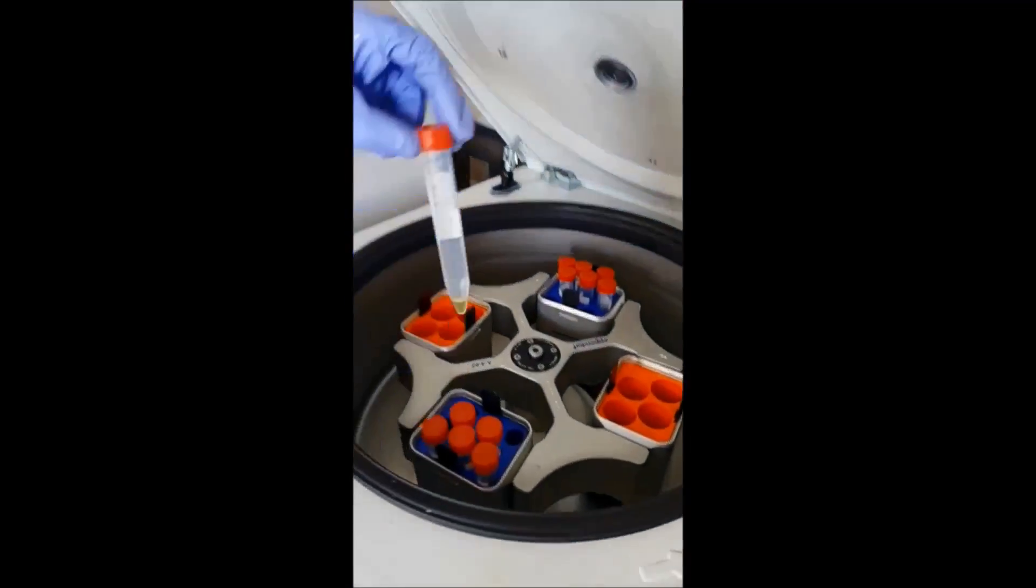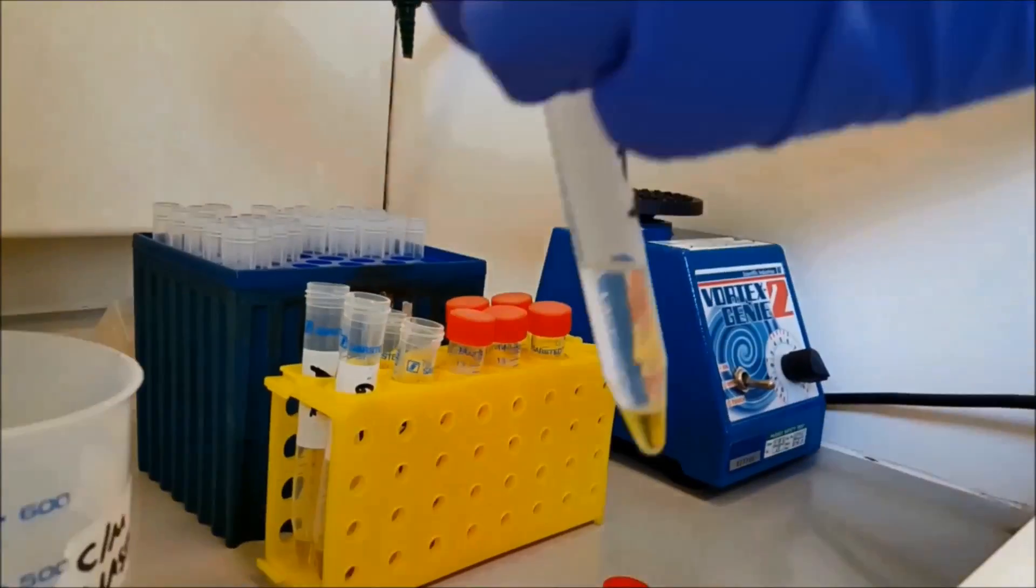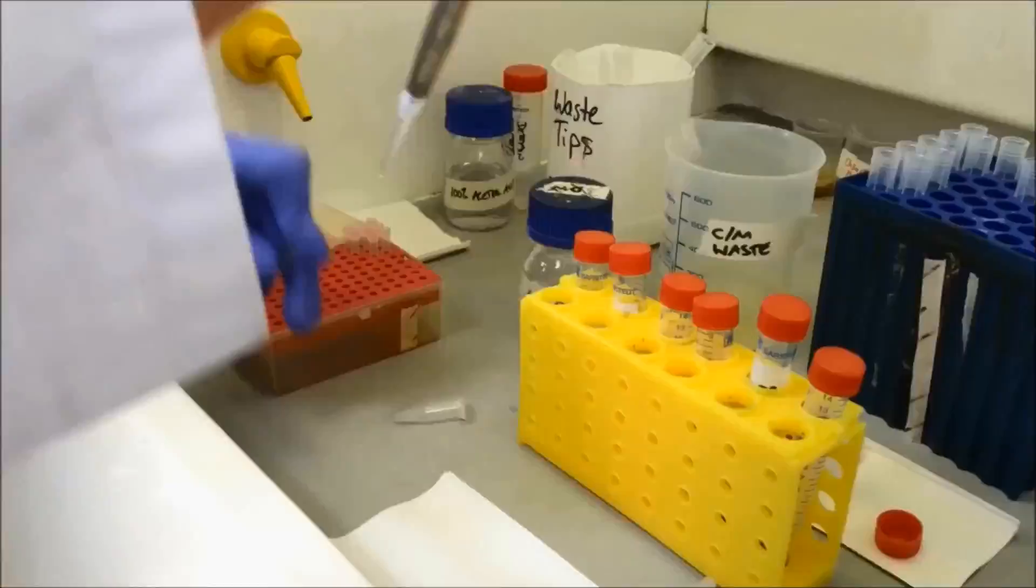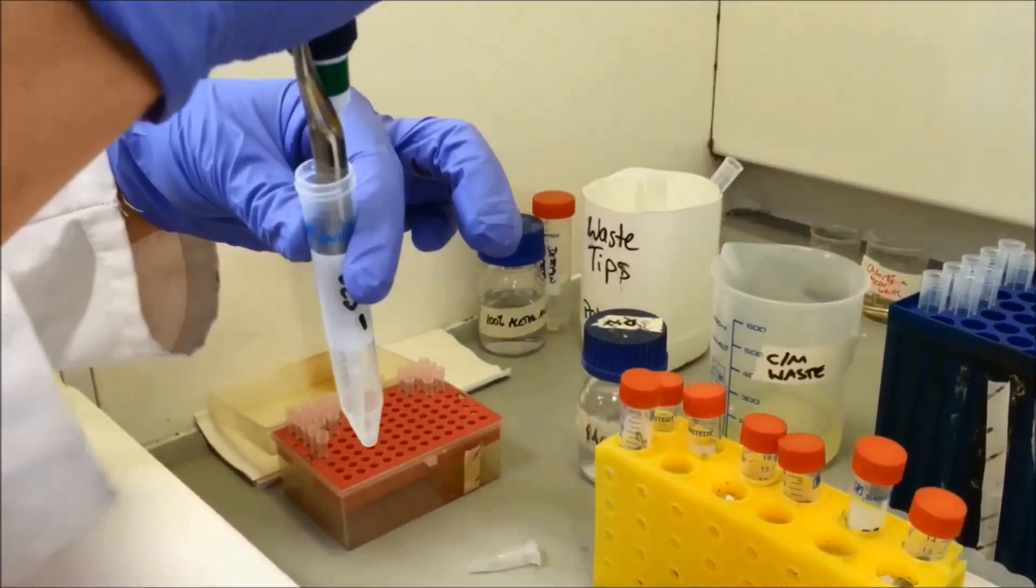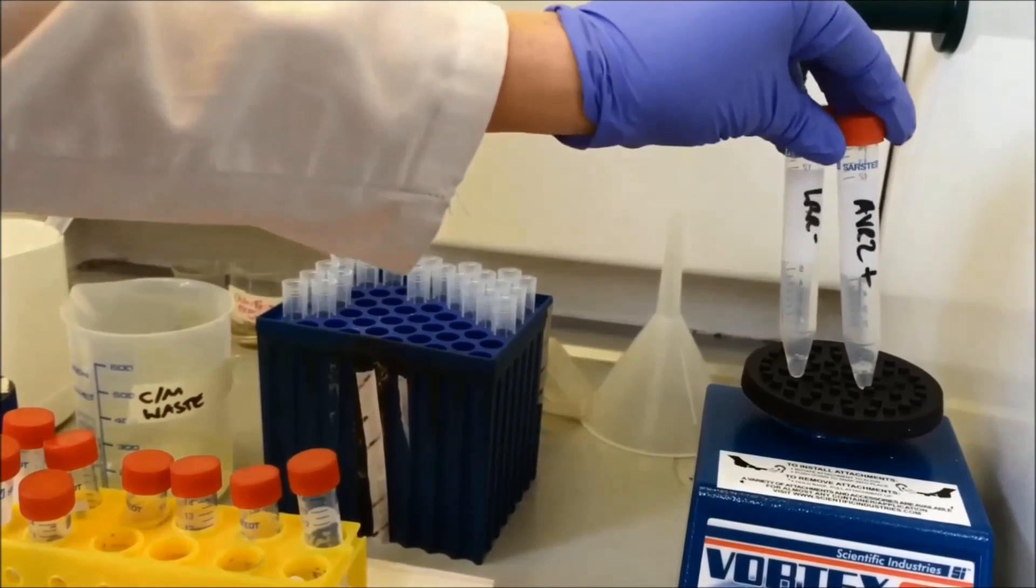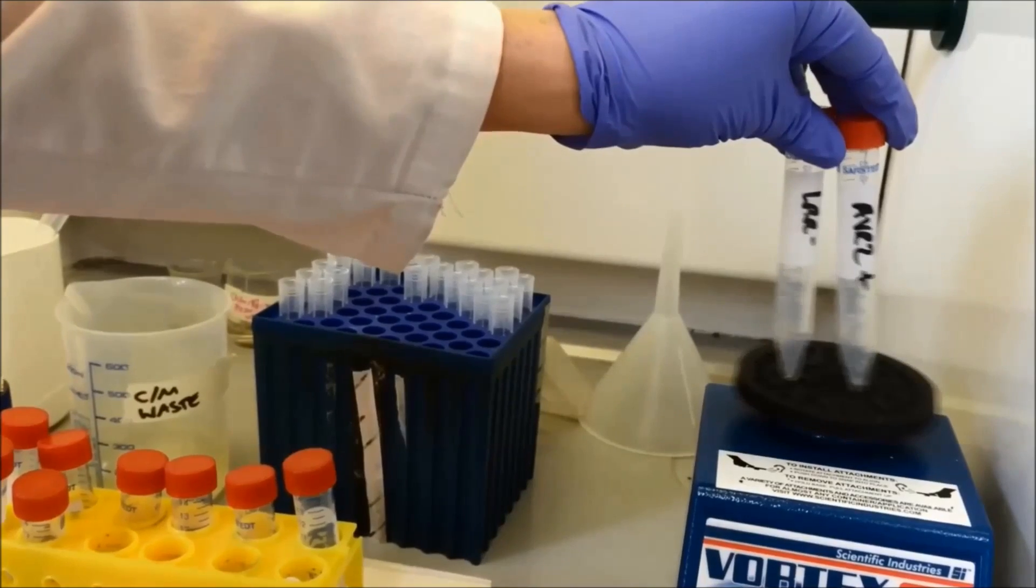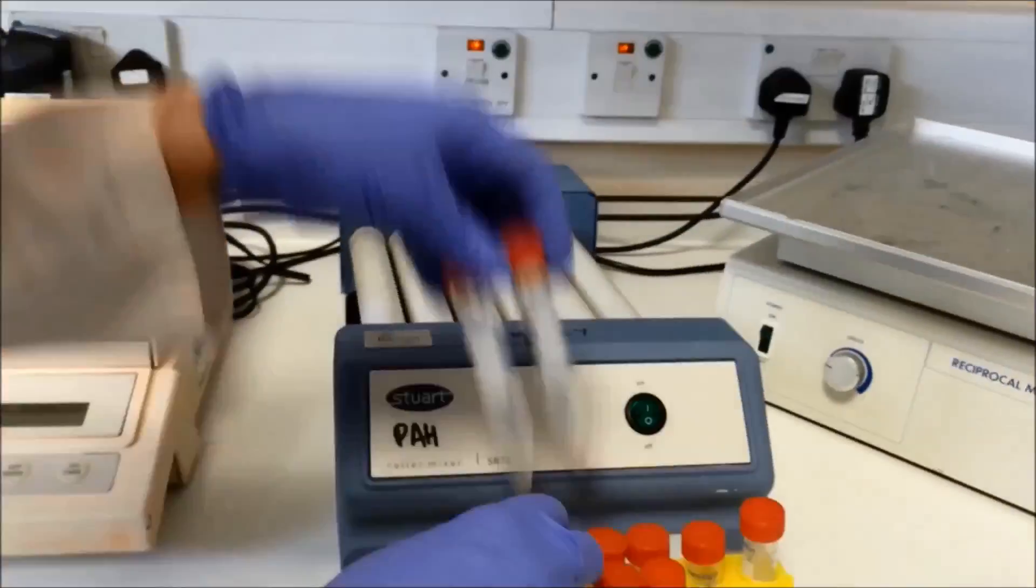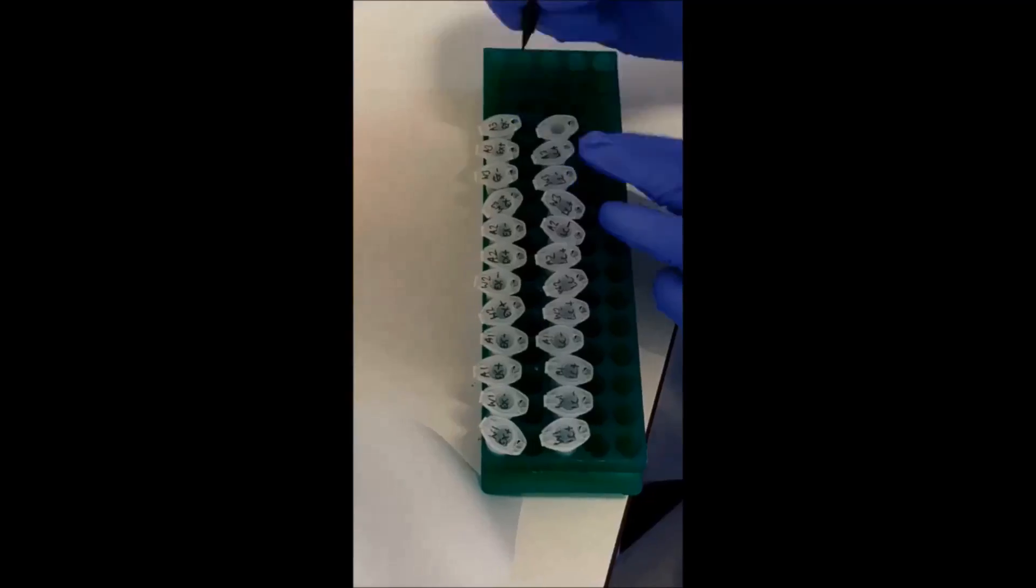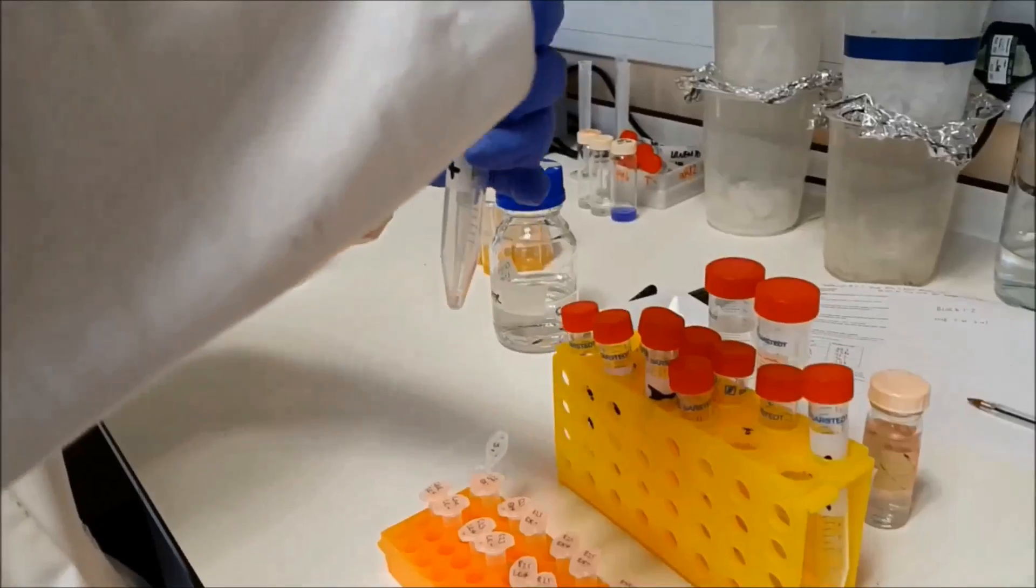We use a centrifuge to spin the sample tubes very quickly. This brings everything together in the bottom of the tube. We use a vortexer to thoroughly mix the samples. We spend a lot of time opening, closing, and labeling tubes.